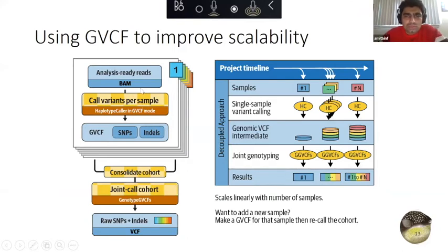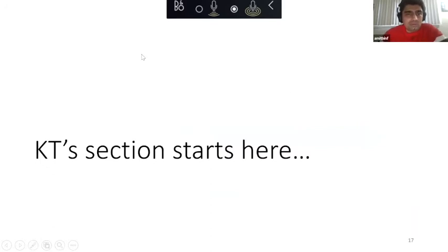Now we have the database ready with all the samples and we can run genotype GVCFs on the GVCFs to generate a VCF file which will only have the variants. This VCF file has only variant locations as opposed to every single location in the genome. And it has variant information for all the three samples. The beauty of this process is it really solves the N plus one problem because you can update the database whenever the samples become available.